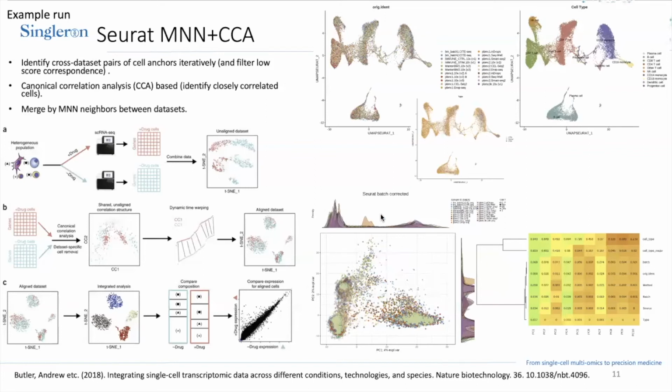mixed. And we can also see this from the marginal PCA, where these different components of PCs are still split. There could be a small batch here, represented by the orange color, that may have a unique group of cells.